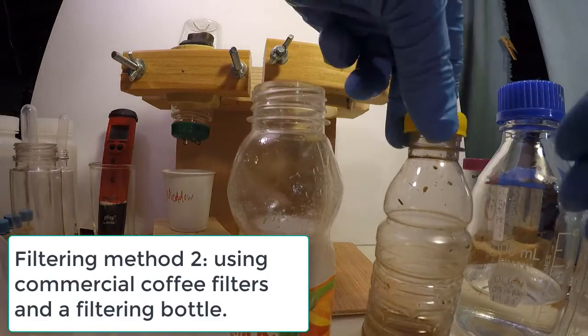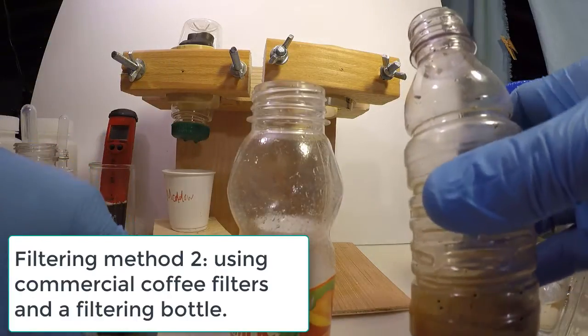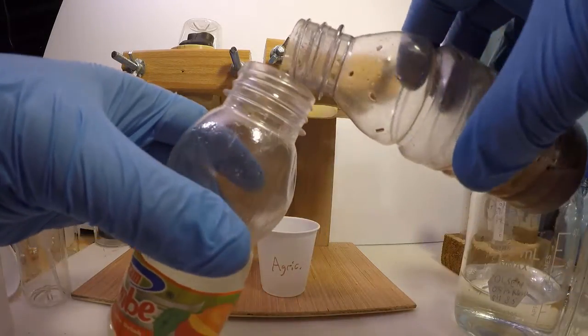In the second method of filtering, we just pour the settled solution into the second filtering bottle with no need to use a transfer pipette.